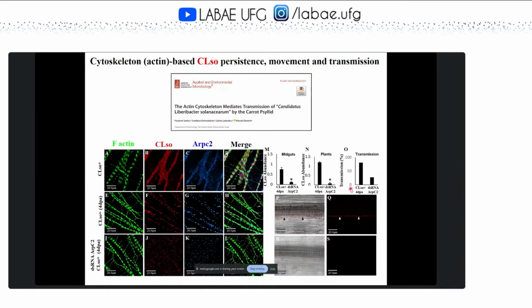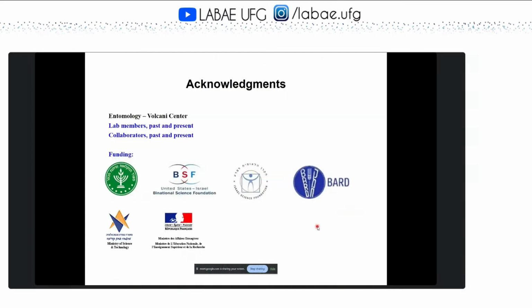You can see that almost every experiment we do, we try to use those imaging methods, and they are always nicer than doing PCR or other molecular ways. Now, if I summarize, I just wanted to put focus on how you can employ and use imaging and localization techniques. In recent years, and maybe the last 20 years, there is an explosion of methods that you can use in this regard.